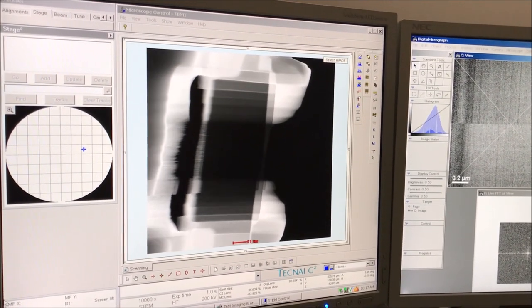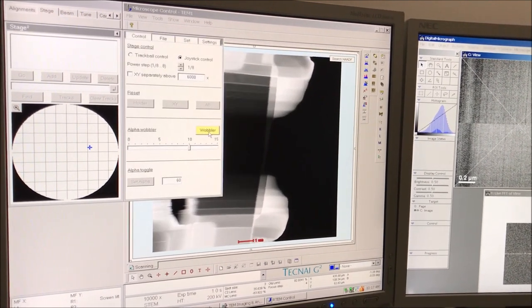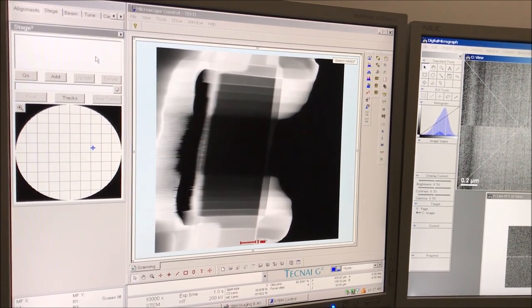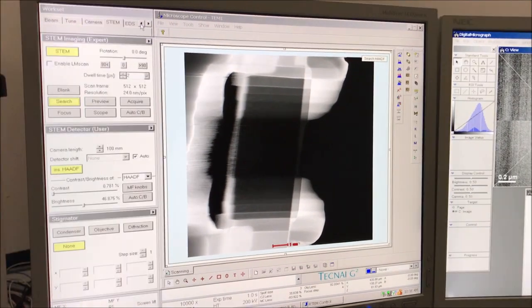Navigating back to the stage tab, expanding the flap-out arrow, and turning off the alpha tilt wobbler when done. Generally speaking, people don't set eucentric height directly in STEM mode — they set it in TEM mode first and then switch into STEM mode to align the microscope. Also keep in mind that the eucentric focus method cannot be done while in STEM mode; you can only do that in TEM mode.